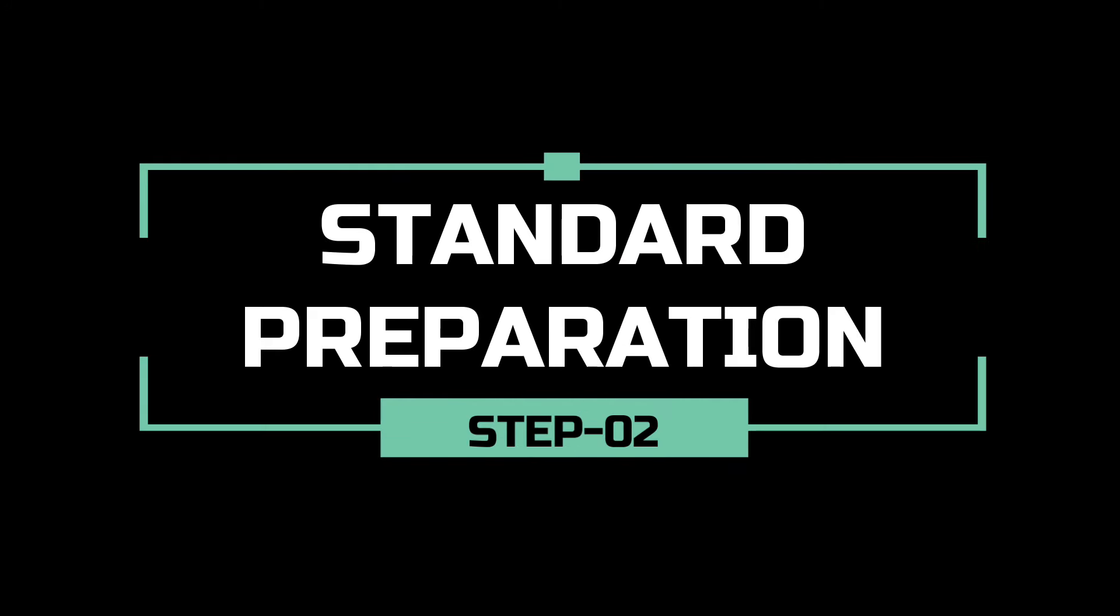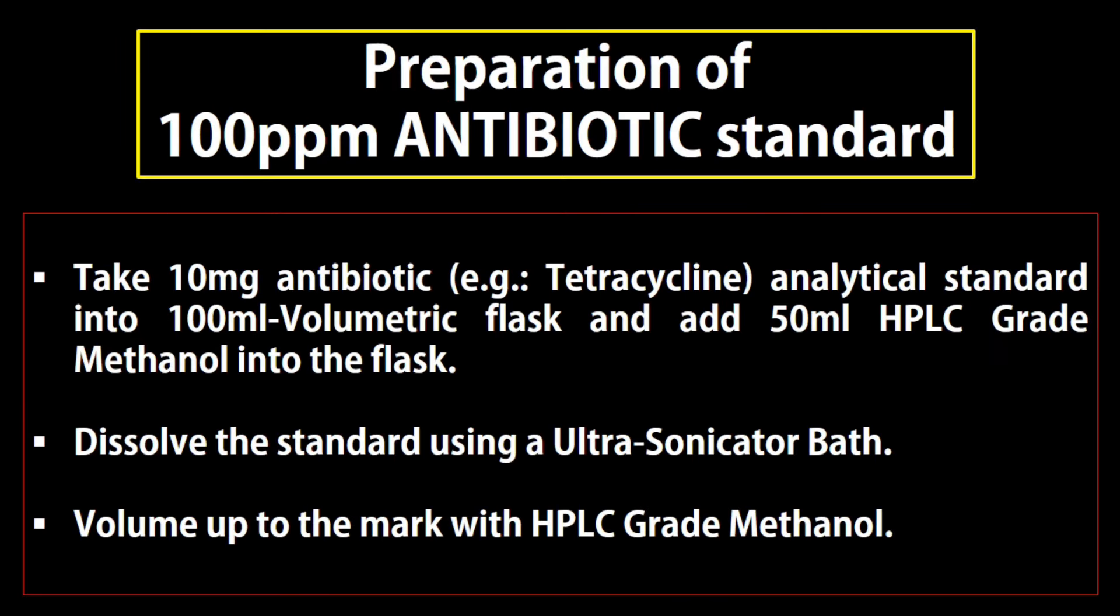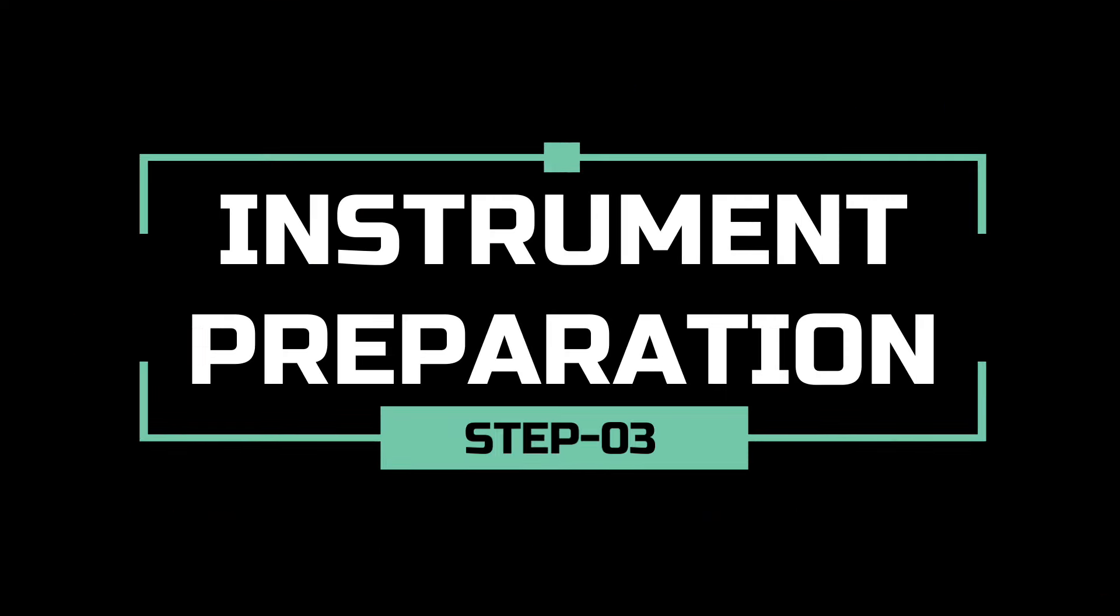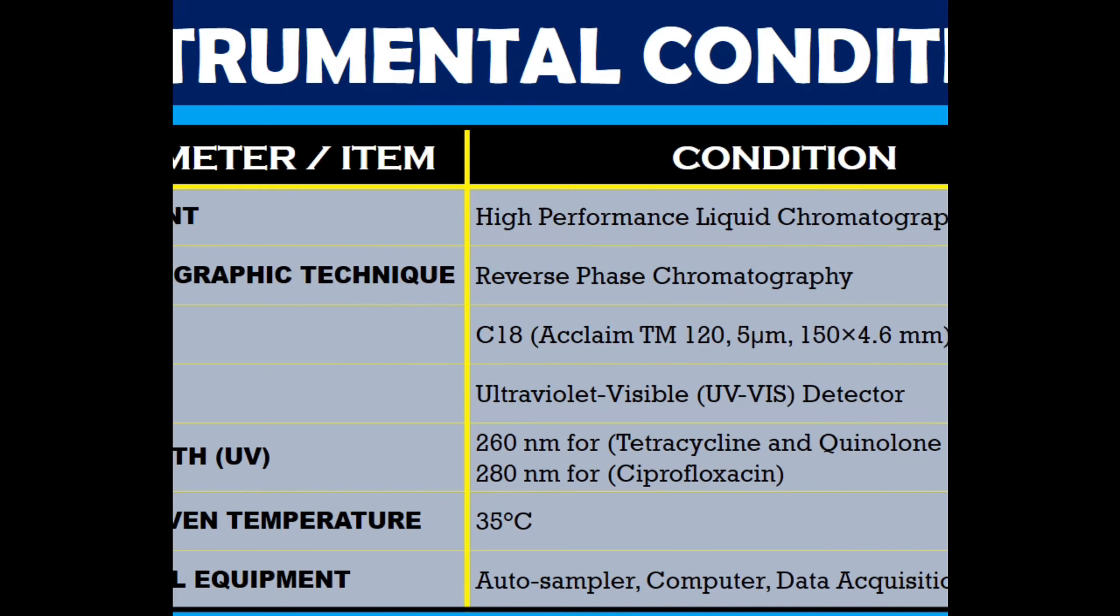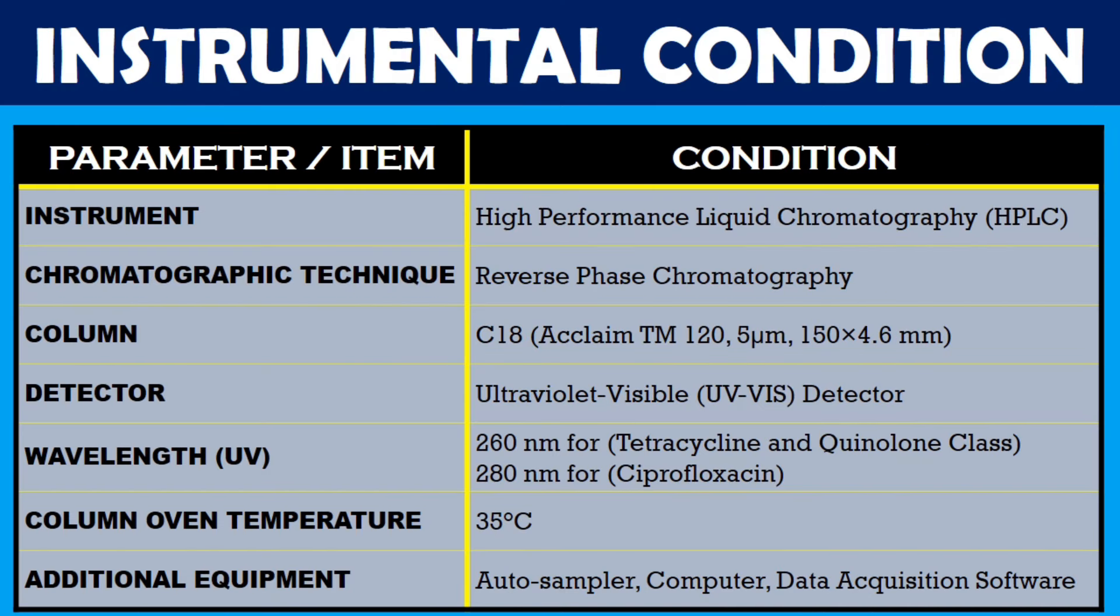Now, we will prepare standards. Dissolve 10 mg antibiotic standard in HPLC grade methanol to make 100 ppm antibiotic solution. Let's go for the instrument preparation. Instrumental conditions are shown in the display. So let's set the HPLC system accordingly.